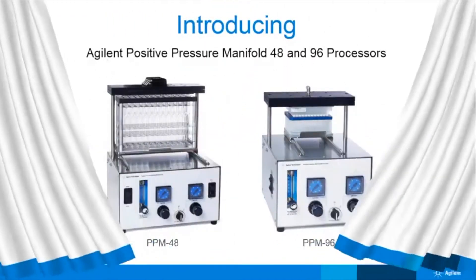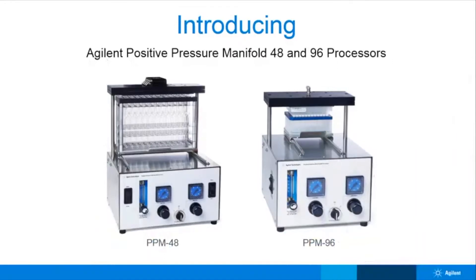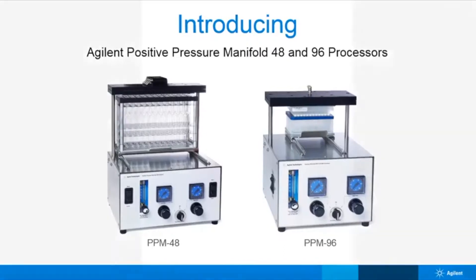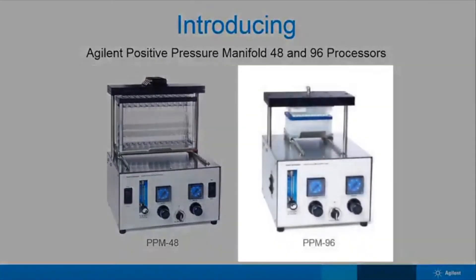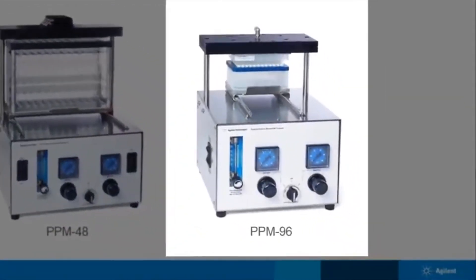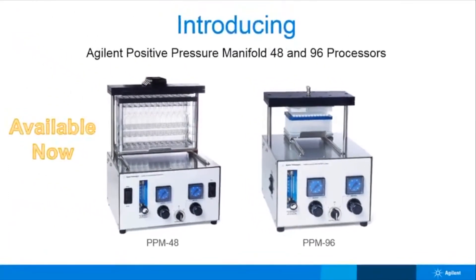I'm so excited to introduce you to the Agilent Positive Pressure Manifold 48 and 96 processors, also known as PPM 48 and PPM 96. The PPM 48 is our cartridge-style processor that allows for the simultaneous processing of up to 48 one-, three-, and six-mil cartridges. Our PPM 96 is designed for 96 wellplate formats, as well as Tabless one-mil cartridges and Agilent Versaplates. And the great news? These PPMs are available to order right now.